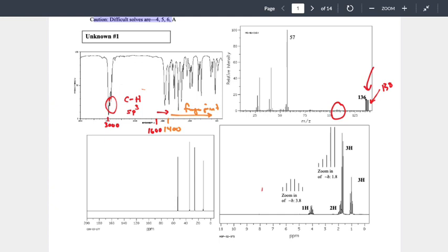They're 2 units. That's a fragmentation pattern where what you lost was not bromine. So bromine is still connected to the molecule there, and we're seeing 2 peaks because half of the sample is bromine 79, the other half is bromine 81. Those peaks are so small, it's really hard to see and interpret, which is why I go through and draw in when there are scenarios that could potentially happen like that.